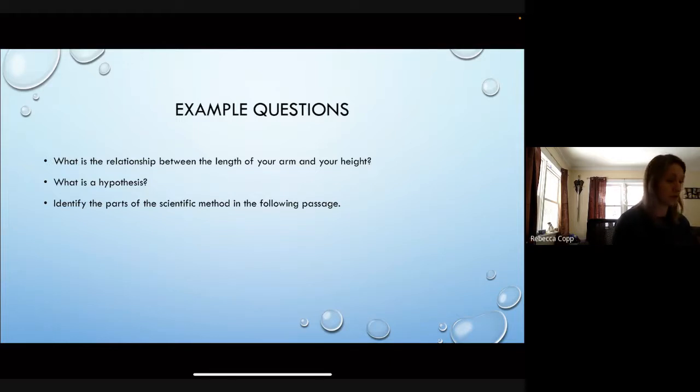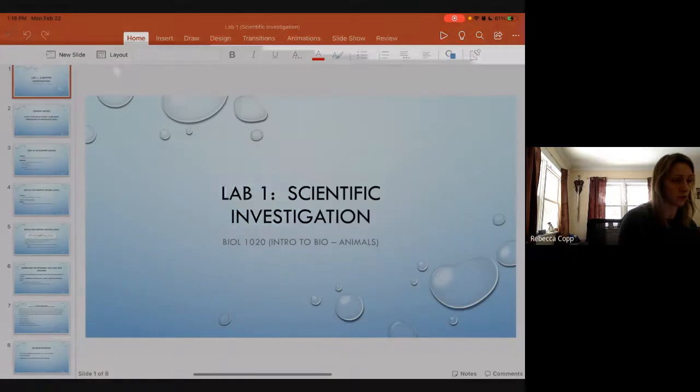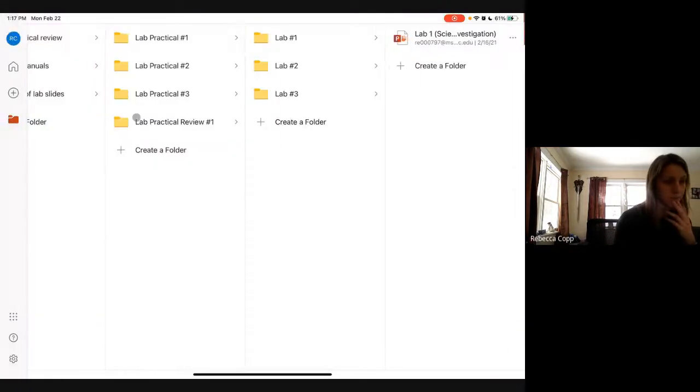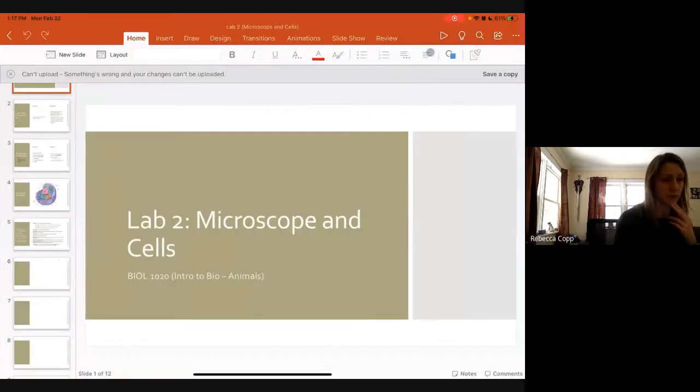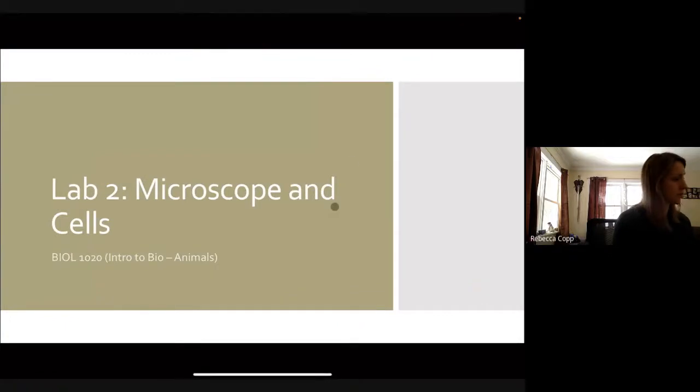Do you have any questions on lab 1? Nope. Okay, so we're going to go to lab 2. I apologize, this takes a couple seconds. And this is going to talk about the microscope and cells. Okay, so microscope and cells.